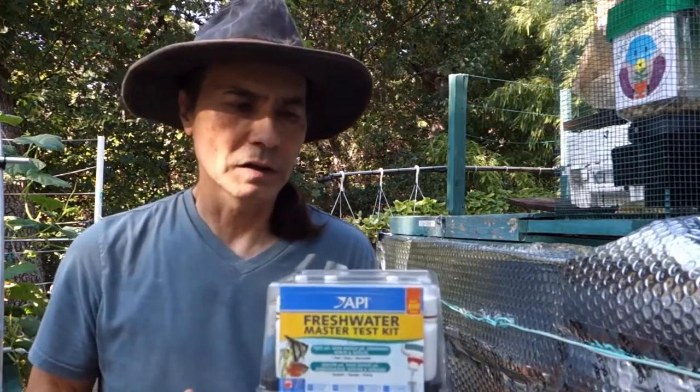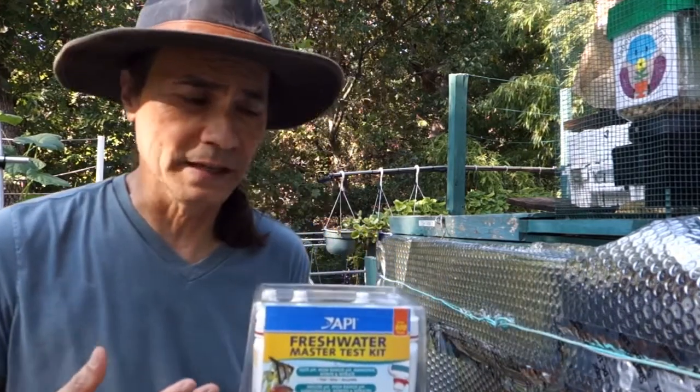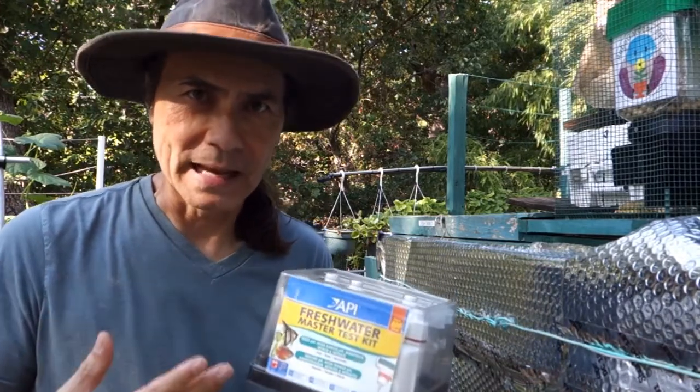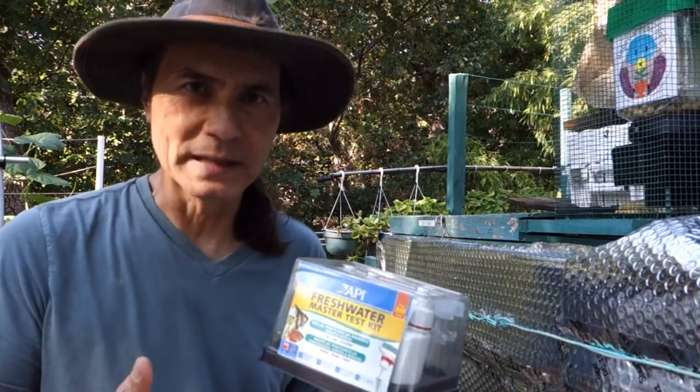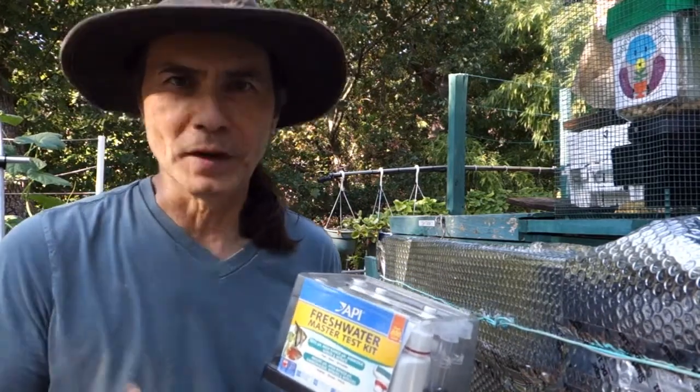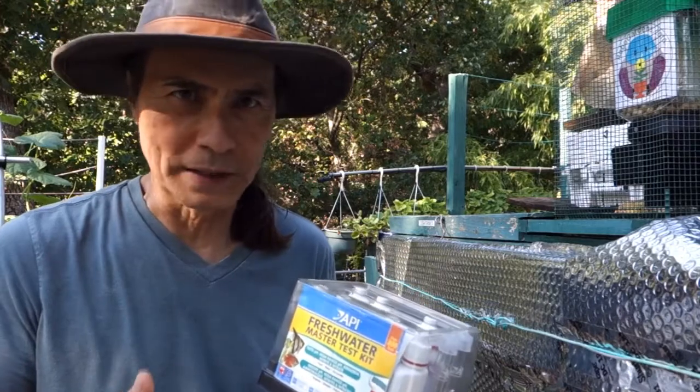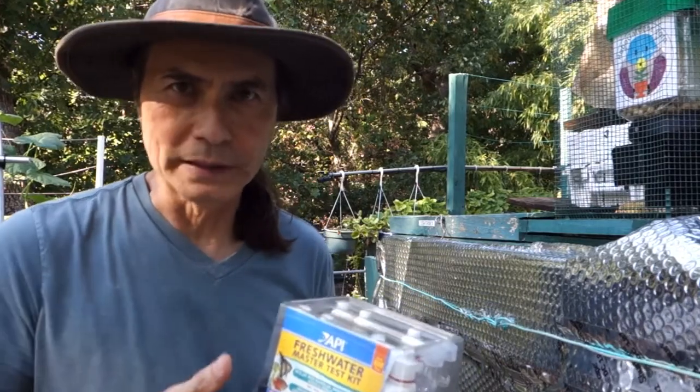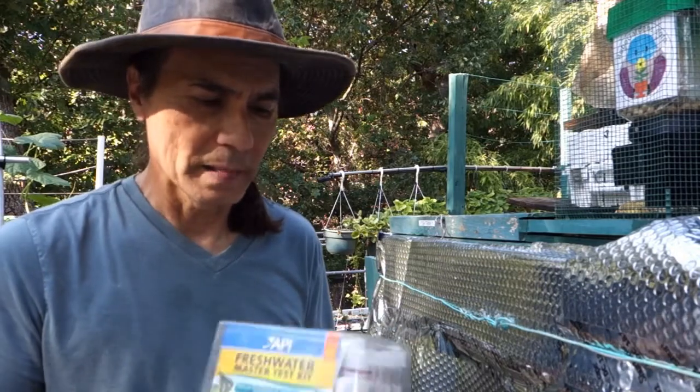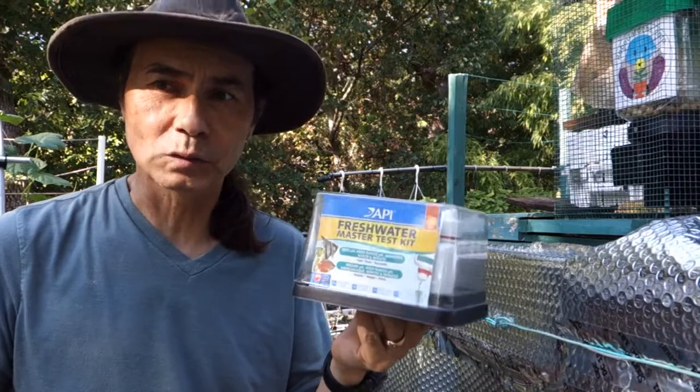There are a few problems with it as far as I'm concerned. One, it's kind of a pain to run these tests. Two, if you get busy like I am and it says, for example, wait five minutes to read the results you typically forget about it. You come back in 30 minutes and the results are all brown. You have no idea what the readings were.